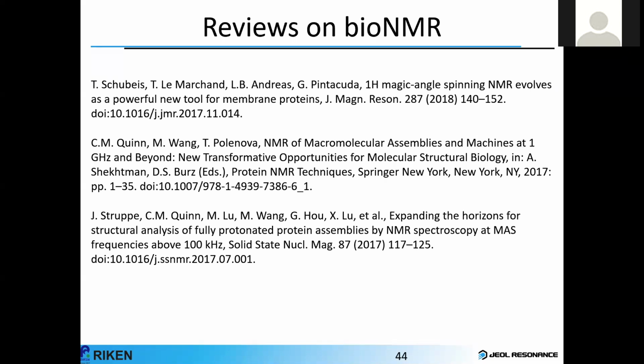And of course, JEOL has one which they claim spins up to 120 kilohertz. But that's also getting you into 280. So you're getting about 80% of the speed of sound, and that's where the uncertainty comes. And now if you start putting in cooling gas, pressure, humidity comes in, and then your sound speed changes. So the point is that if you're getting up to 80% of the relative velocity of sound, I think crashes are imminent. And that's why we see that it becomes the limiting factor.